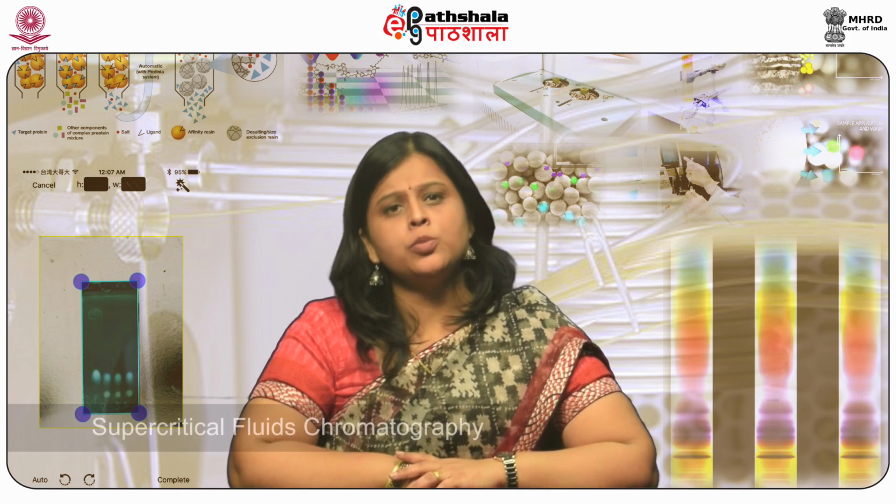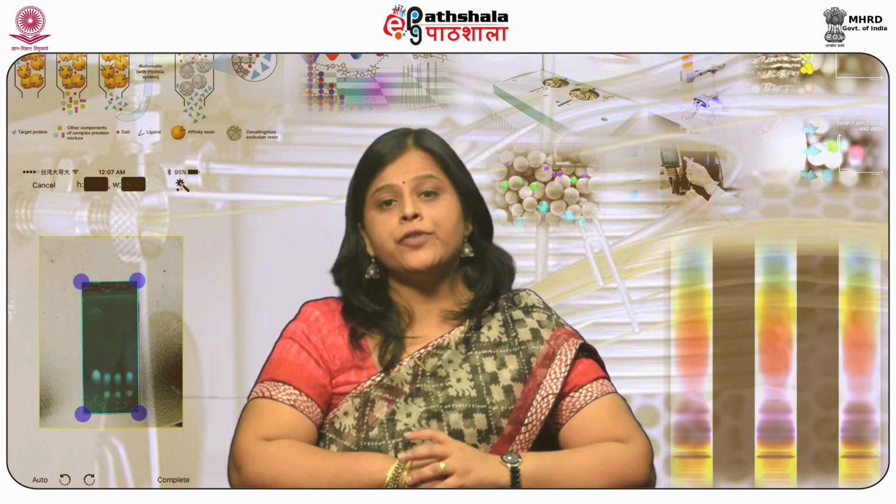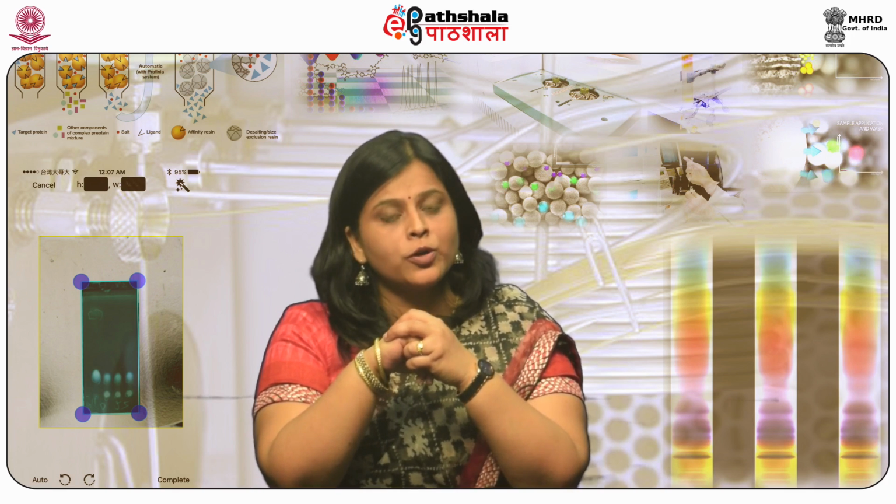To summarize, in this module, we have introduced the technique of supercritical fluid chromatography. Supercritical fluid chromatography offers numerous unique features which can be employed for analysis of a broad range of molecules. Supercritical fluids have properties that are intermediate between gases and liquids. The advantages of supercritical fluid chromatography include fast and efficient analysis, a wide choice of detectors, low cost, and eco-friendly mobile phase. Carbon dioxide has been the solvent of choice for carrying out supercritical fluid chromatography.